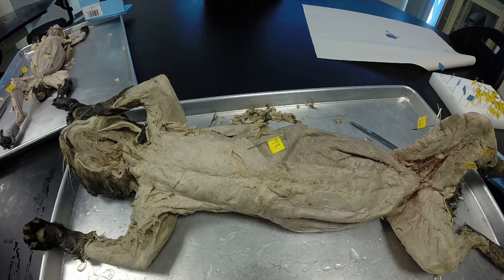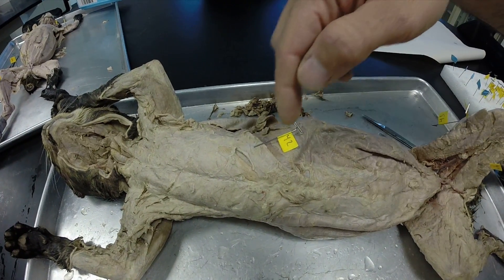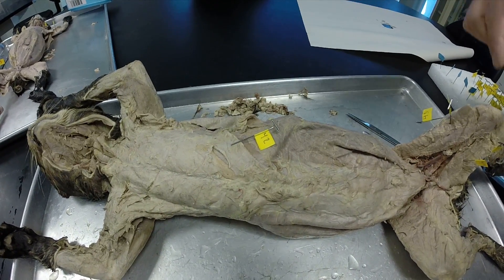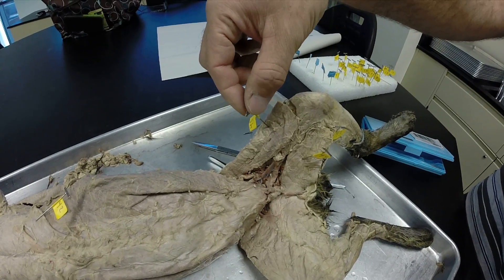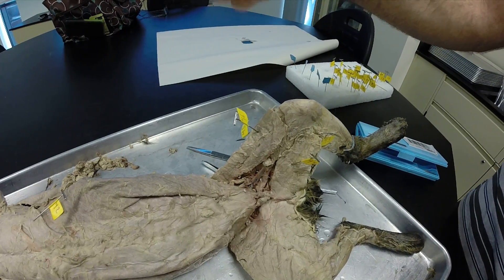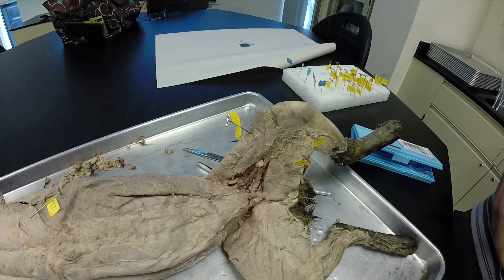So what is this one? That's our xyphohumeralis. If it really is a xyphohumeralis, there should be nothing after it, which there isn't, so we feel pretty good about this one. Over here we have the sartorius. You can see that it's where it's supposed to be — it's the most superficial muscle. Makes sense if it's sartorius.